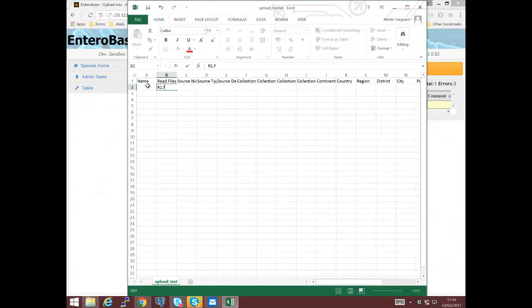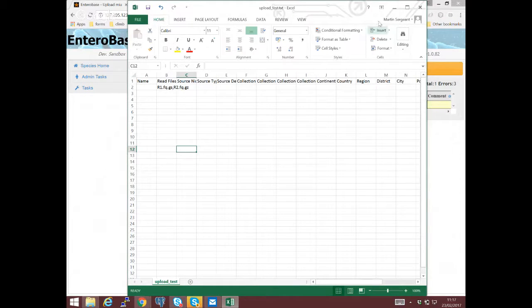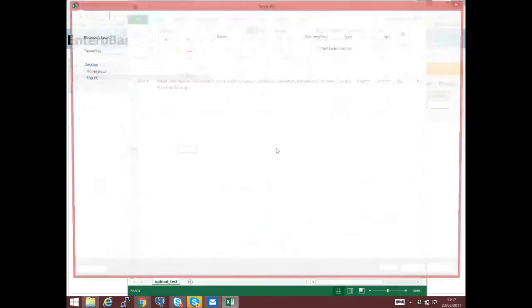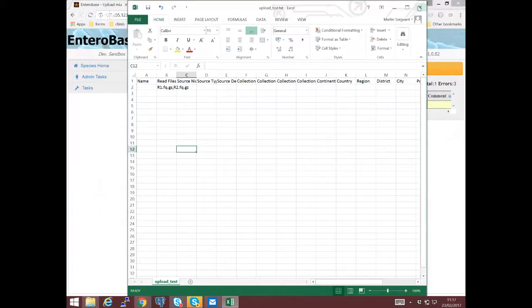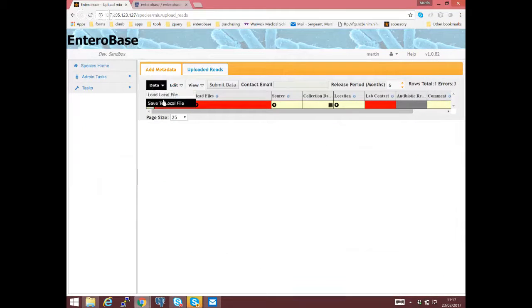For instance, you put what you like in there, and then save it. Then you can go and upload.